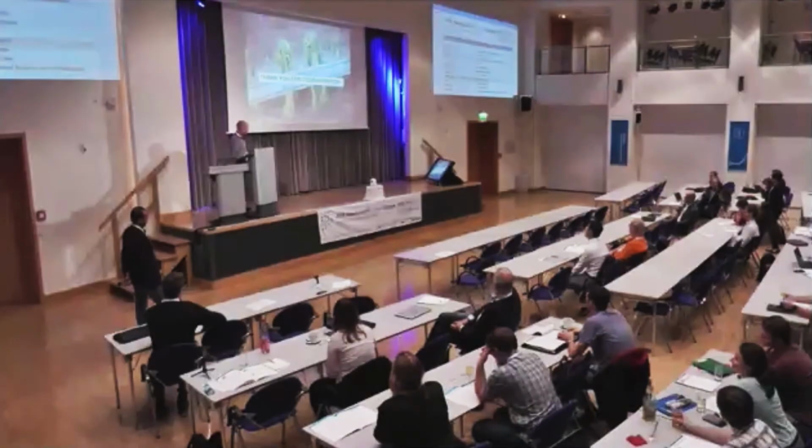With our atomic force microscopy, we have a long acquisition time for the images. It takes 20, 30 minutes to have one image. Especially for the interaction of oligomers, we would like high speed, in order to see the first moment of the interaction of this kind of molecule, to be sure that these structures go to the raft domains, and also to see the formation of these clusters.